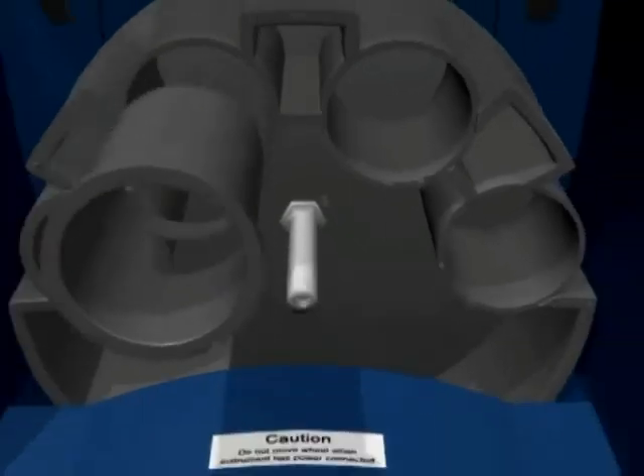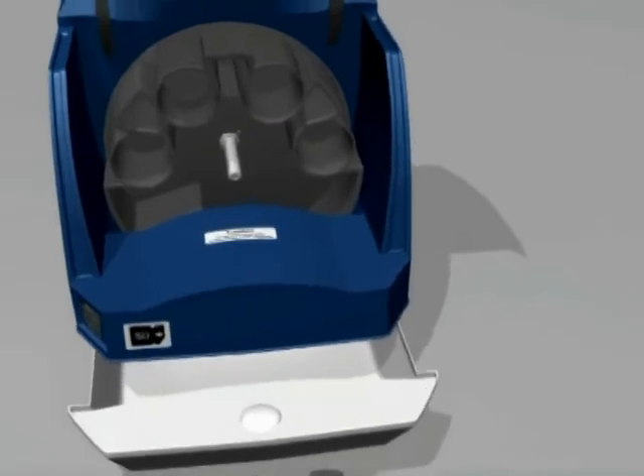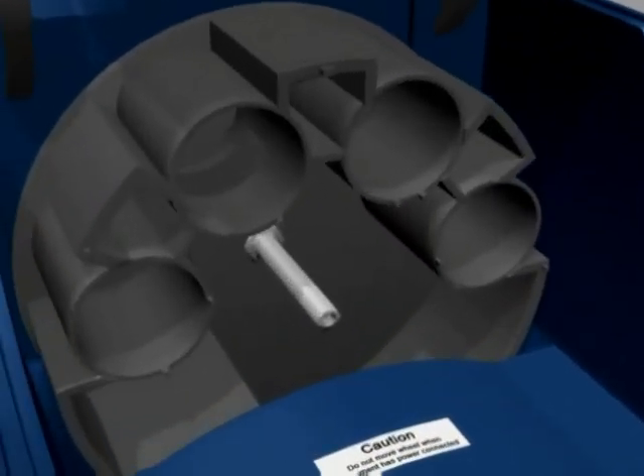As each cylinder is removed, it is a good idea to line them up in the order and rotation they were removed, to keep them in the correct order for refitting later. The cylinders can be dusted if necessary, and the cavities from which they have been removed can also be dusted. The sample handling wheel can be removed if there is foreign matter stuck behind or around it, or if the cavity is very dirty, but removal is not recommended as part of routine cleaning.